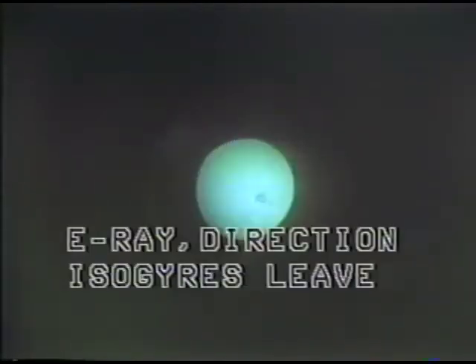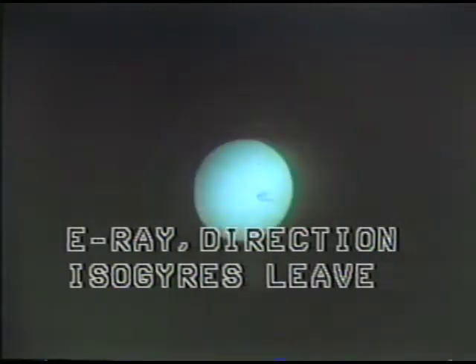Well, you can use this dynamic test as I rotate the stage and watch the direction of departure of these isogyres to indicate, in this flash figure orientation, the position of the E ray. In other words, these isogyres leave in the direction of the E vibration direction.